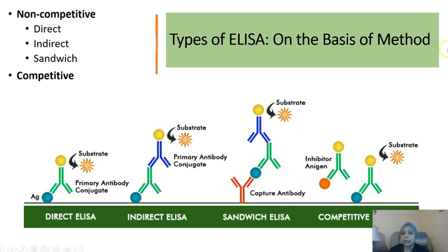And now the second antibody is going to be binding to hopefully the epitope. If you have a nice clean epitope that you're looking at, it's going to bind to that portion of your protein. You then use a secondary antibody. This is your secondary antibody that contains your enzyme-linked conjugate. And then you add the substrate and you get the reaction, the interaction, the color change that you can quantify. This is going to be super specific and allow you to get very nice, clean, quantitative results. These are the type that we are going to try to do for CREB in our class.